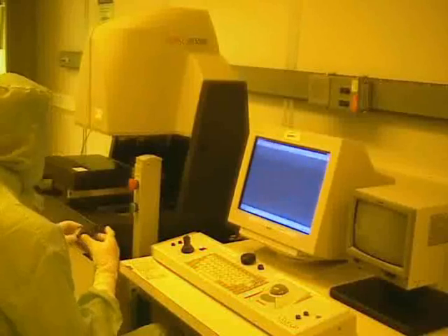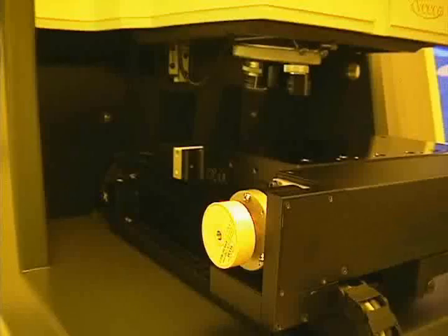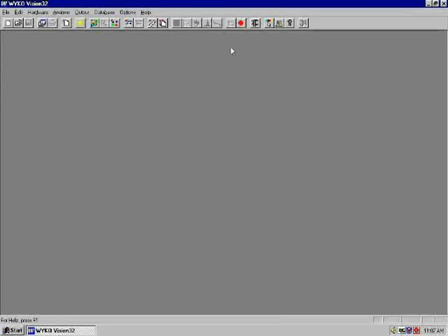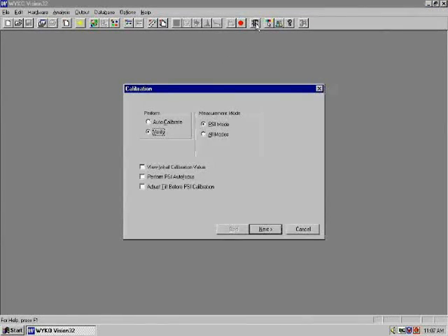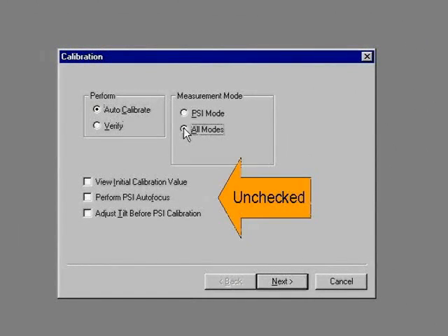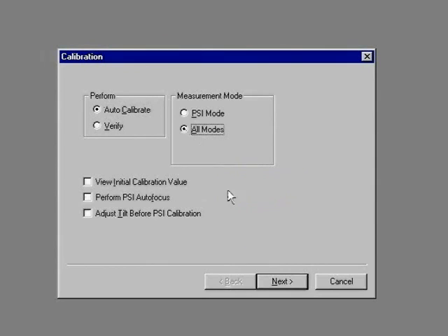The sample is placed on some buttons to prevent it from coming in contact with the box. Mount the calibration sample on the stage with the label facing you. We begin the calibration by clicking on the calipers. We select auto-calibrate. We select all modes. Leave these boxes unchecked.